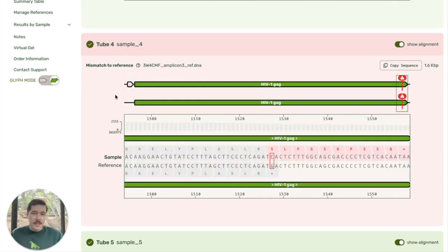So you can see in this example that this is probably a bigger problem. So we previously had a stop, but we have got a SNP again. So this G has been changed to a C, which again is very well supported by the underlying data. And so instead of a stop, this is now a serine. And of course that means it doesn't stop making protein. So there's a good chance that you will have to remake this.